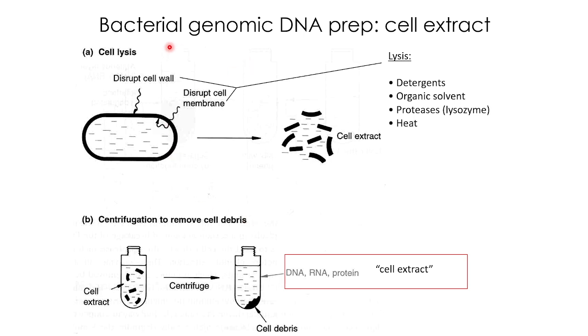So how do you prepare the cell extract? You have the cells, and you disrupt the cell wall via some kind of harsh reagent like SDS, or even basic media like NaOH, that rips apart the cell wall, and the entire material comes outside, where you have the DNA, or the supercoiled DNA, that's the plasmid in the case of a bacterium.